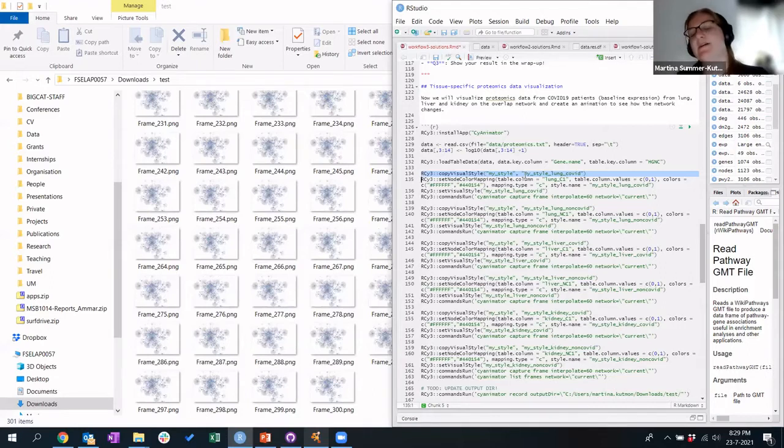So I can just explain it like, look at this, what happened, this gene is not expressed in the normal, but look at this now, what happened in the cancer, they highly express.